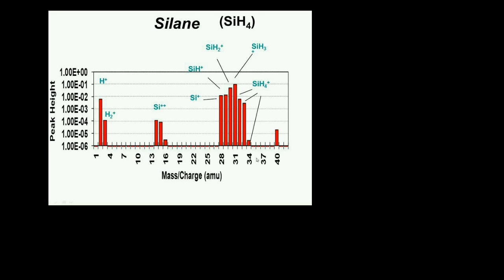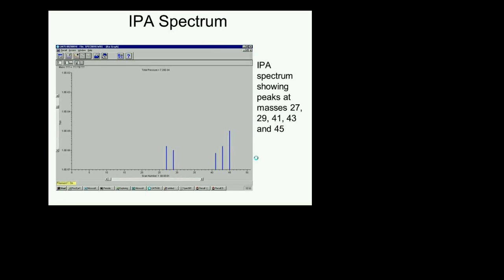So moving forward, now we get away from the standard background spectra, stuff that you will have even if you're super careful, right? And we're gonna look at a few examples of other molecules. It's very common in the semiconductor industry to wipe your system with isopropyl alcohol. It's kind of a kit clean process. You just go wipe everything up, you dry it, then you pump on it.